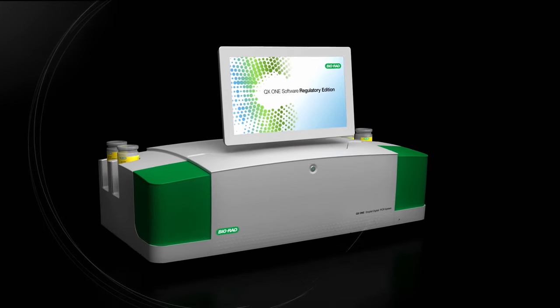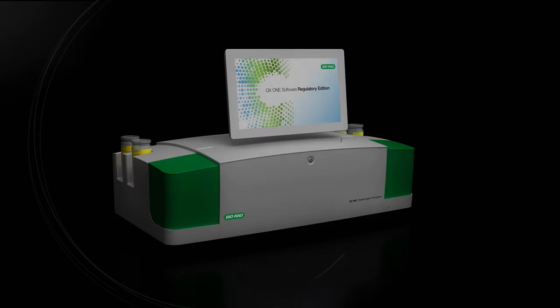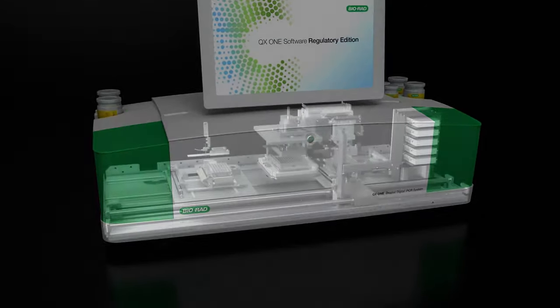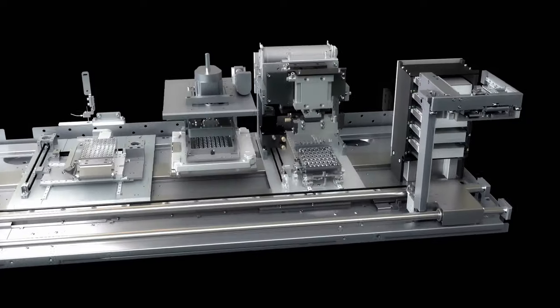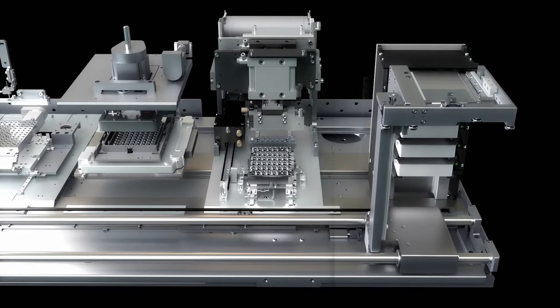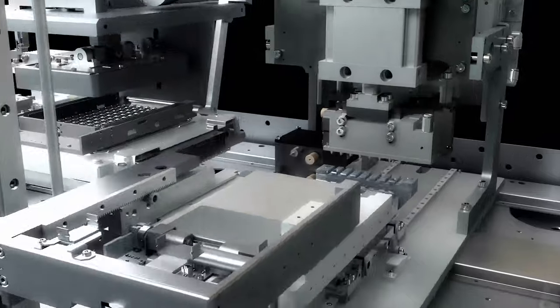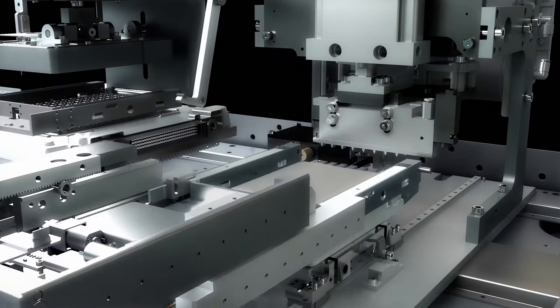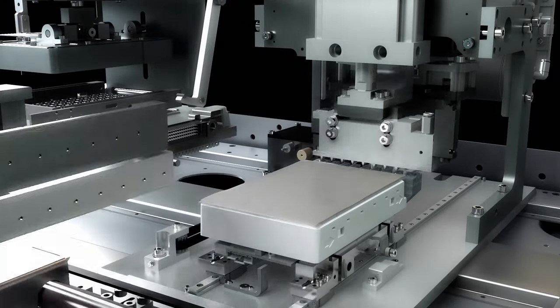A simple five-minute setup to configure the plate is all it takes, and the QX1 takes it from there. Once a run has started, the plate handler moves a single plate from the inbox into the droplet generator section. There, the plates are prepared for droplet generation.